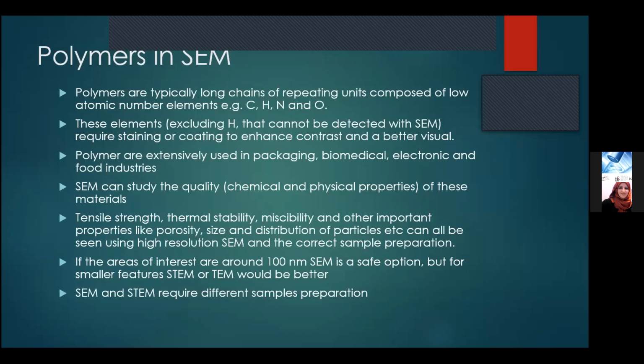If you do not do the correct sample preparation, you will affect the changes that were made on your polymers through the test or the experiment, and alter the effects and introduce artifacts, which will cause you to get inaccurate data or make inaccurate conclusions. So that's very, very important, sample preparation. And we'll be talking about that soon.